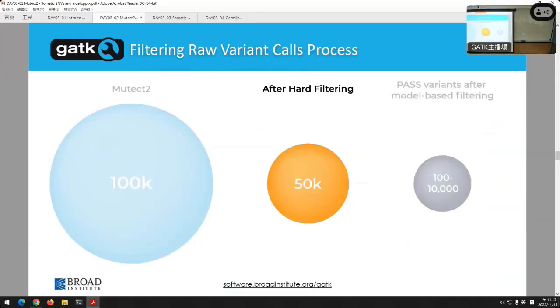As we move on to hard filtering, well, we mentioned hard filtering. You just did some hard filtering in your exercise. We set reasonable thresholds here too in our pipeline, and say, okay, whatever we have with confidence, let's do a level of just hard filter it out here, okay? Let's pass it through once. Let's just toss things that we don't think we're confident enough in.